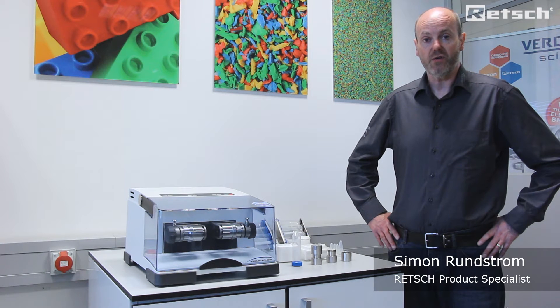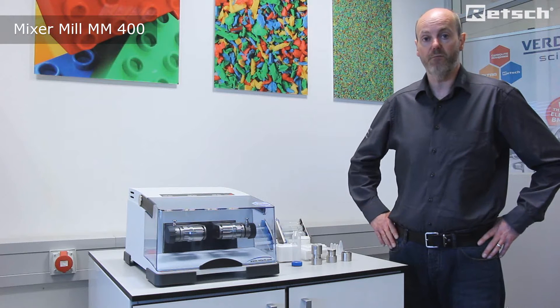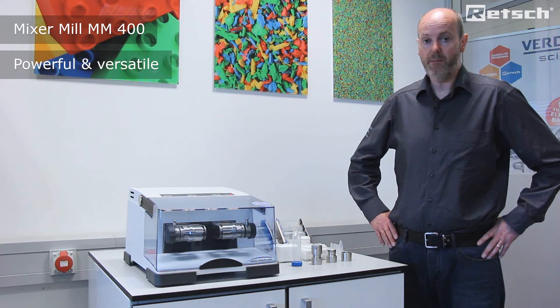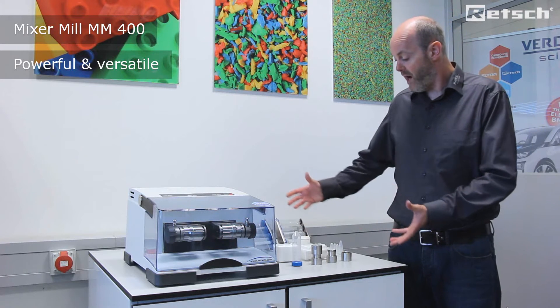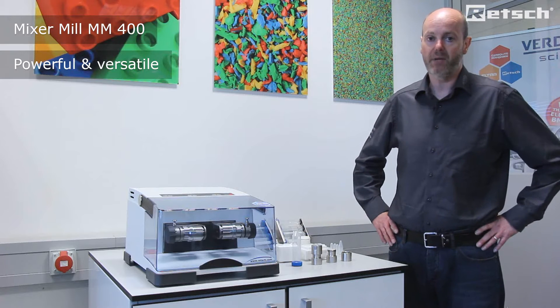Hello. I'd like to take this opportunity to introduce the MM400 Mixer Mill. It is a benchtop instrument within the family of ball mills. It is a very powerful and versatile instrument with a wide range of accompanying accessories to facilitate many different applications in many areas of scientific research.